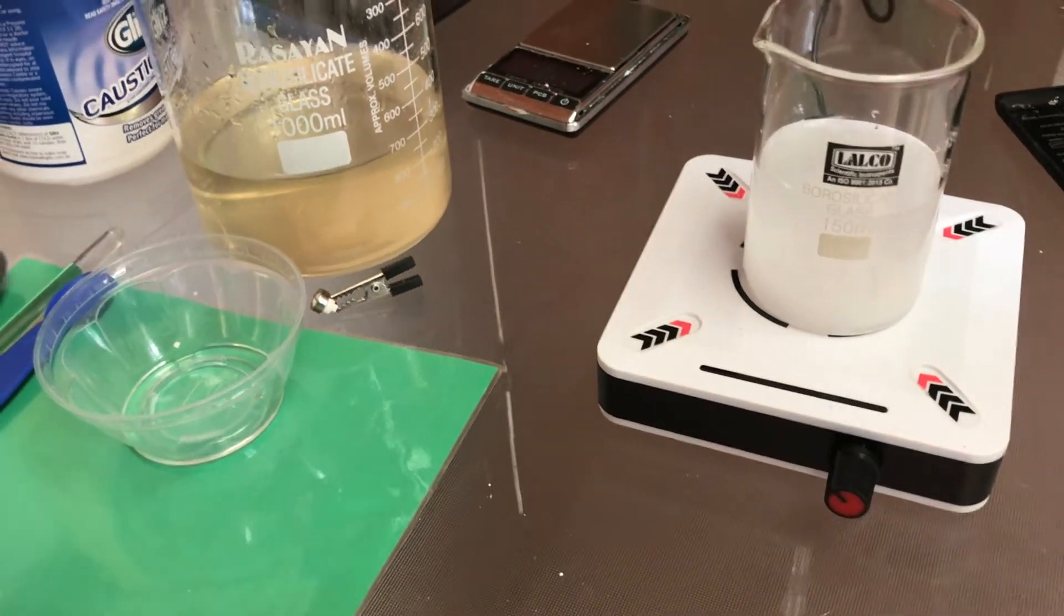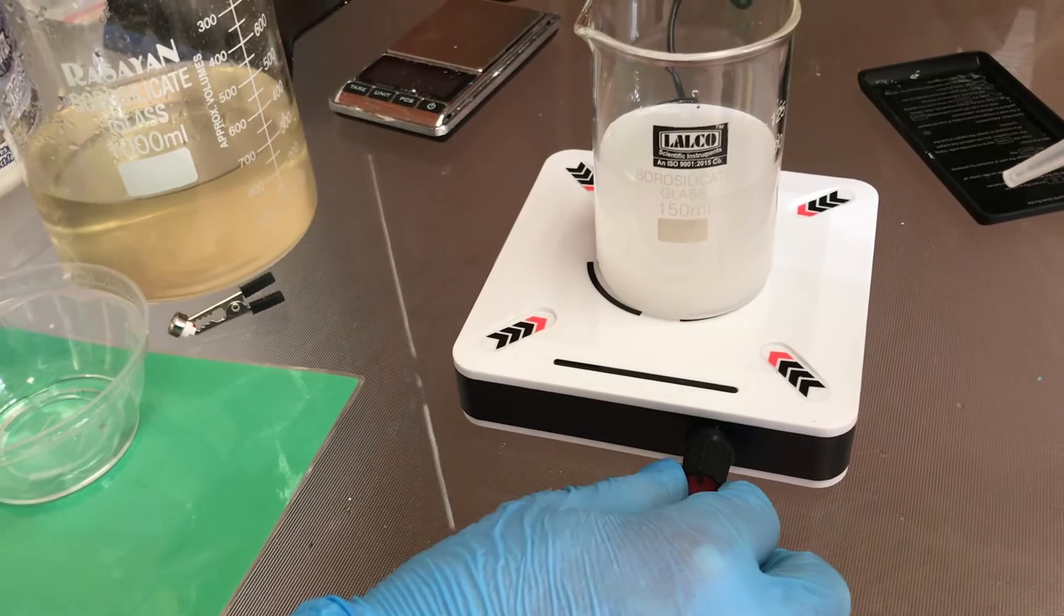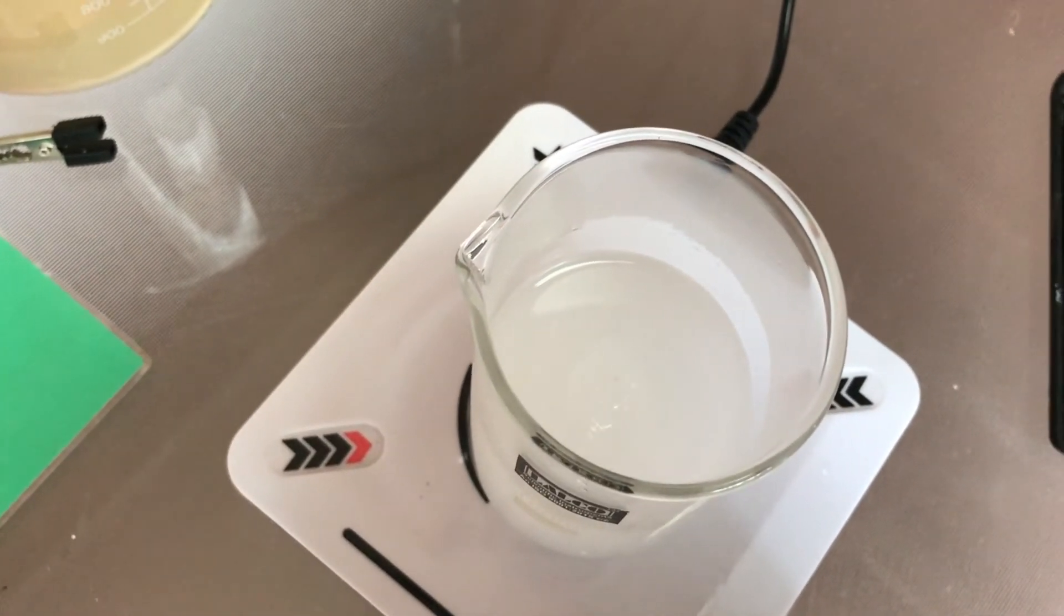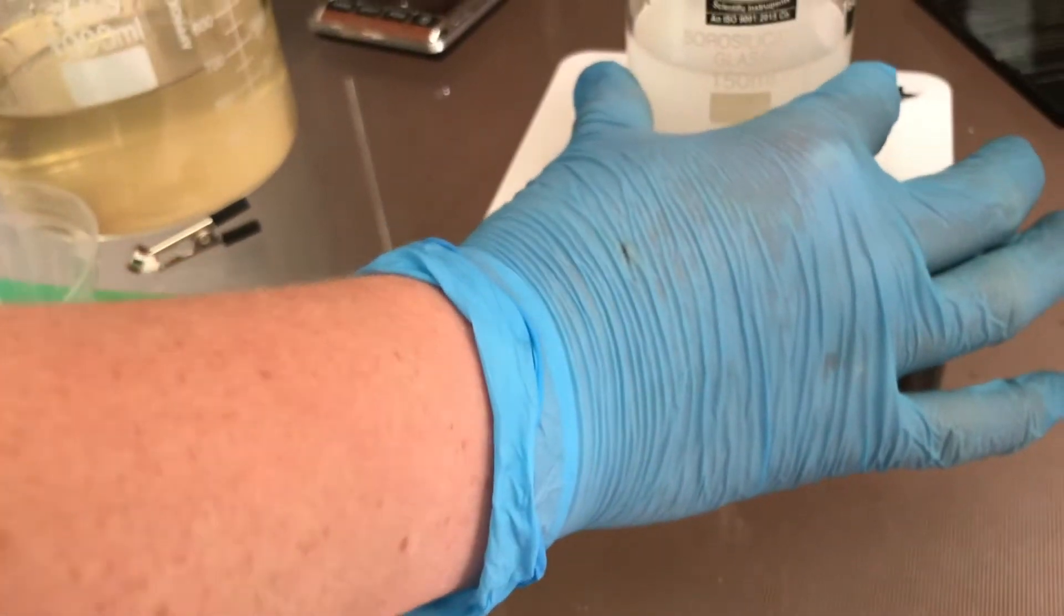Stir until the sodium hydroxide is completely dissolved. You may observe that this is an exothermic reaction as steam has been given off and because it is quite hot to touch.